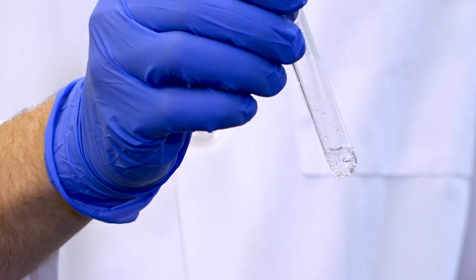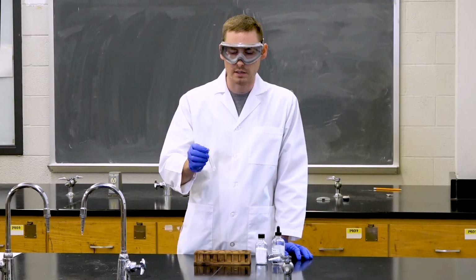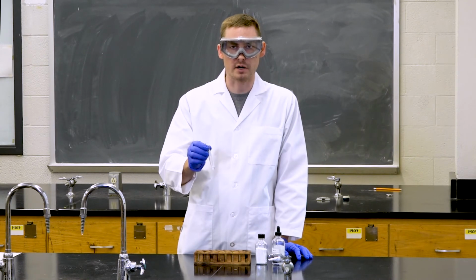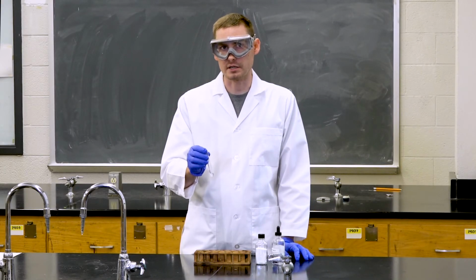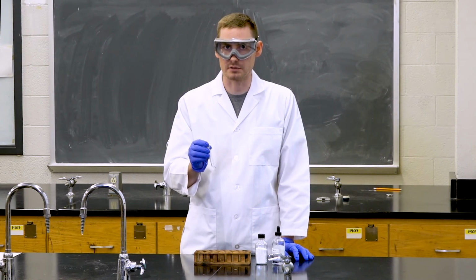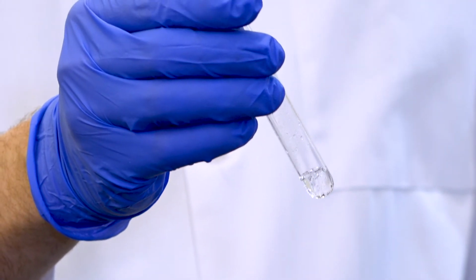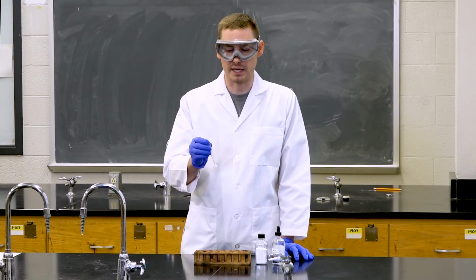As you can see, a gas is released when I add the acid to the solid sodium carbonate. This reaction forms water and carbon dioxide, which is the gas that you can see disappearing from the liquid. This is a similar reaction that occurs when you add vinegar to baking soda or when you take an antacid because your stomach hurts. It produces carbon dioxide, which bubbles away, and this can give us some insight into what reaction is happening and what products are being formed.